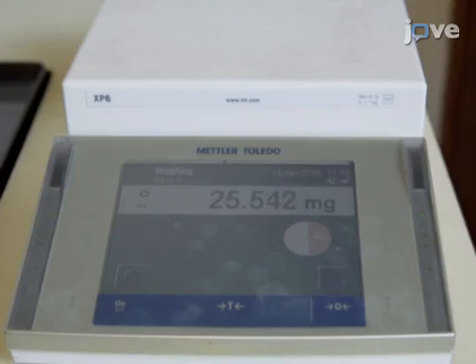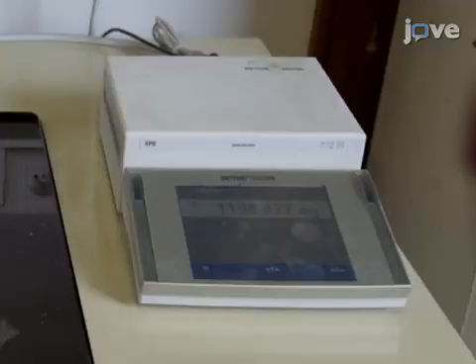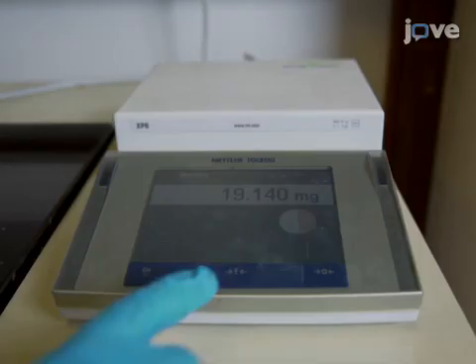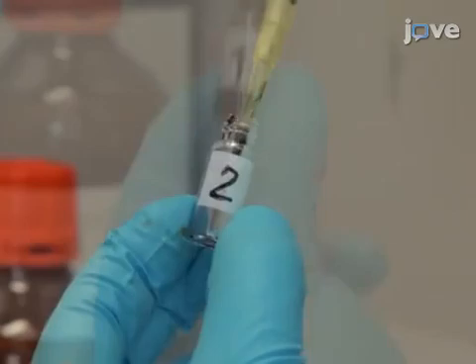Following this, tare the balance with the first vial and add approximately 1100 mg of a shale oil sample. Gently shake the vial to mix the mixture. Place the second vial on the balance and tare the balance. Transfer approximately 25 mg of the prepared mixture into the second vial, and then add approximately 450 mg of the original shale oil sample.